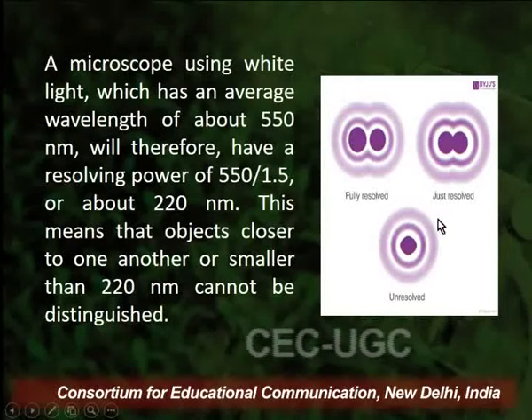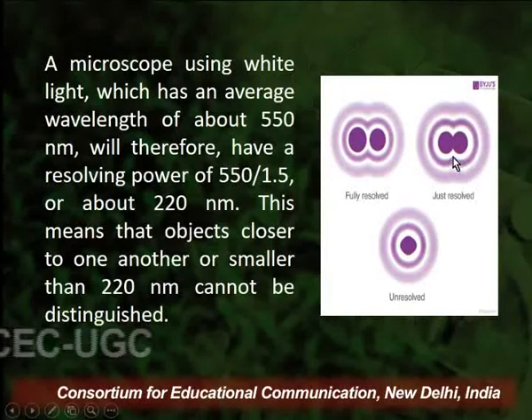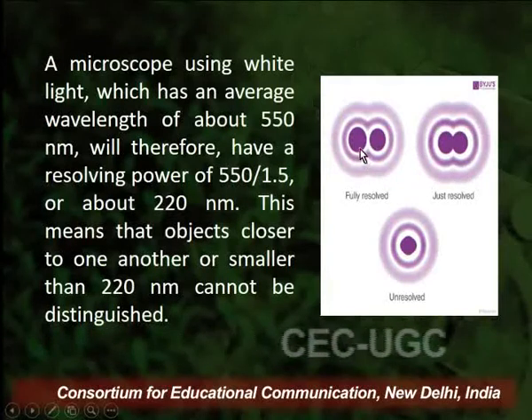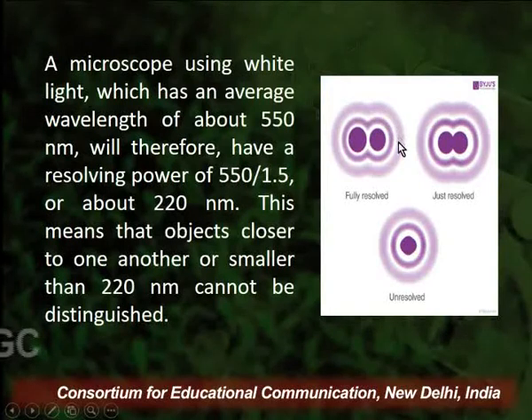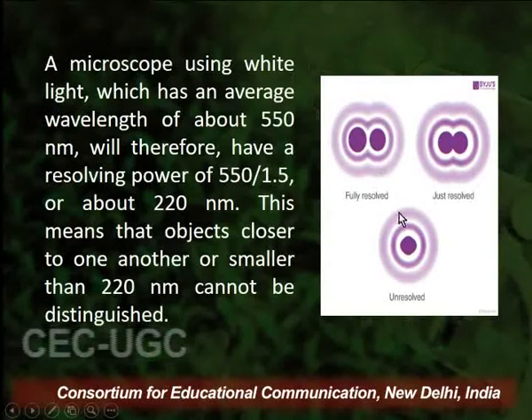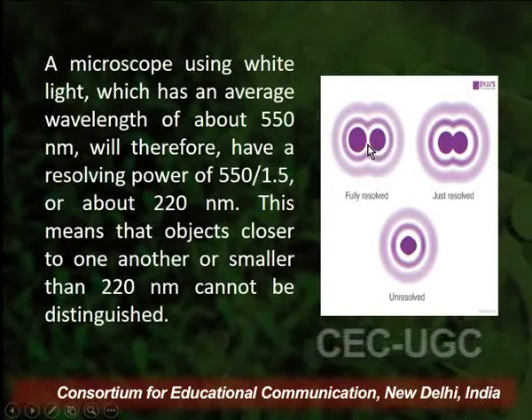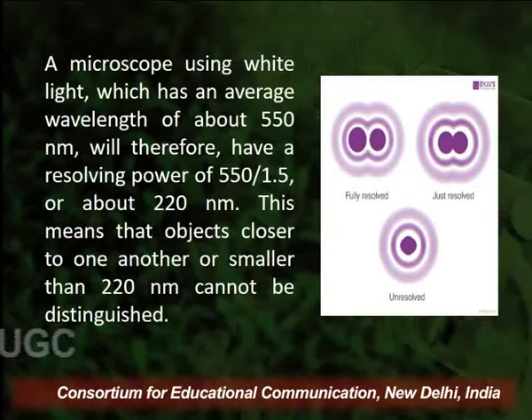But with a higher resolution, we could start identifying them as two distinct points, and with a fully resolved image, these two points, as compared to the previous image, can be distinguished as two separate points.